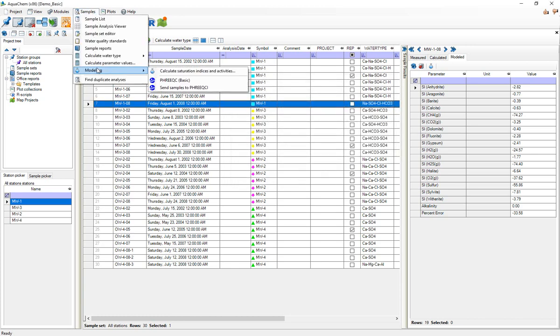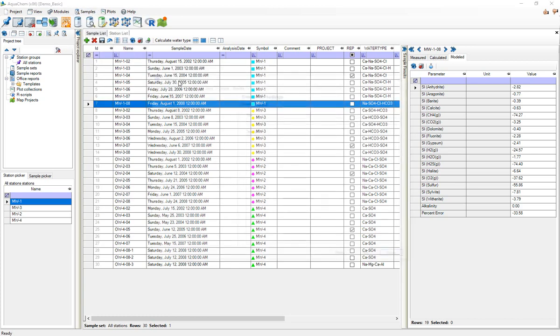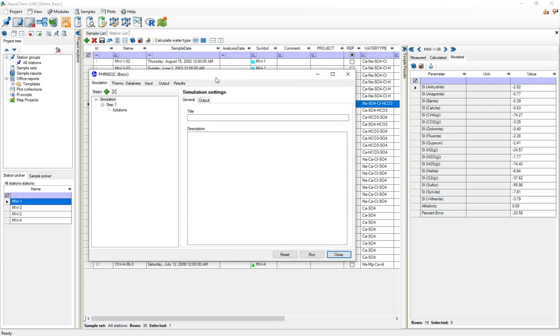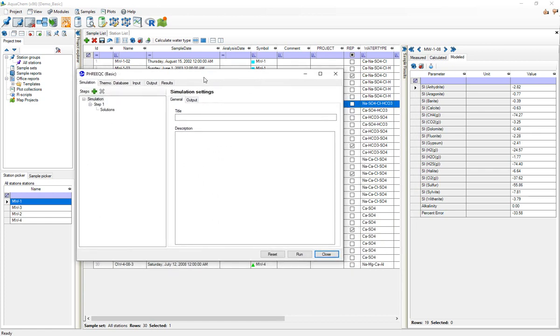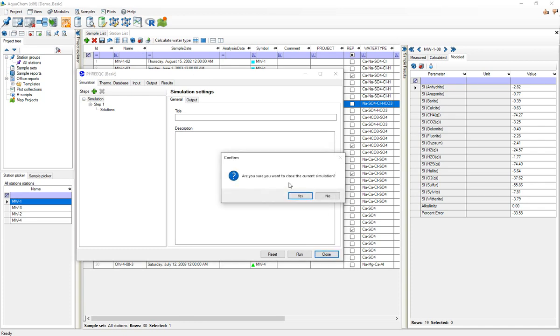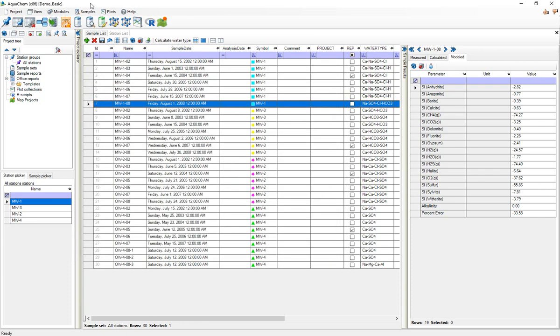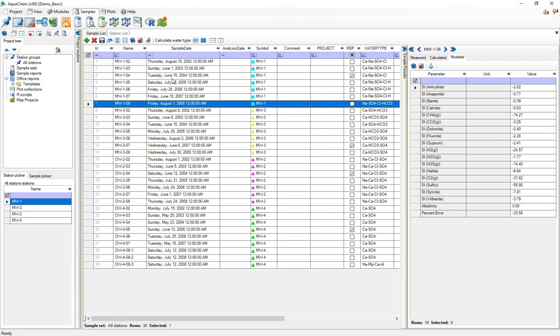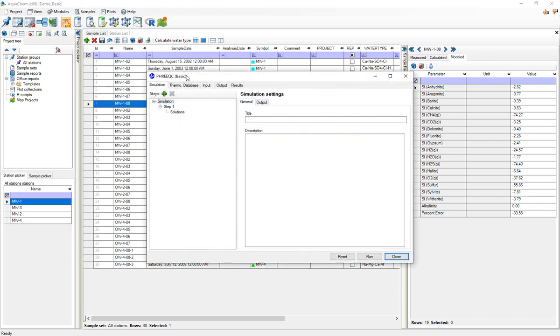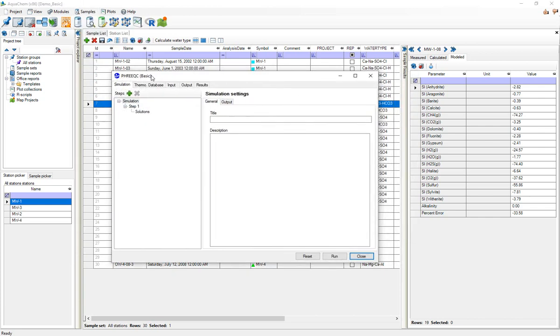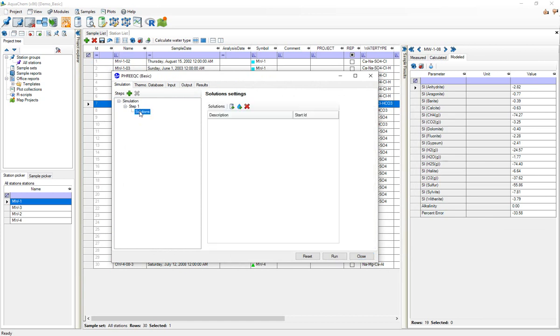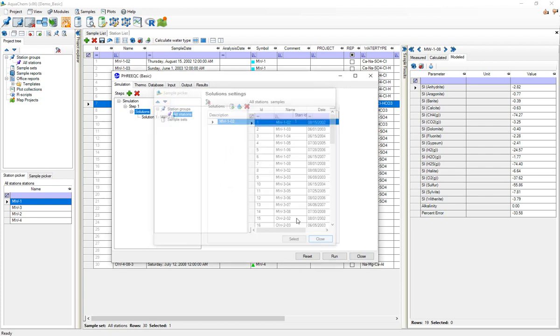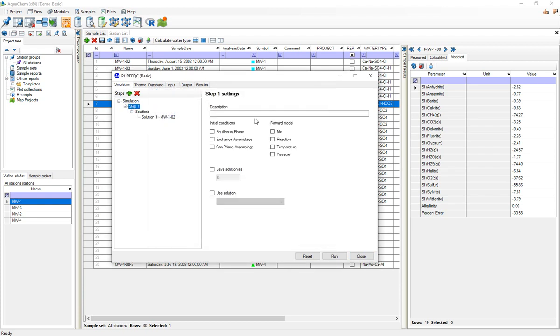You can also set up basic simulations. Again in a later video I will give a demo on how to actually use this but I don't want to make this video too long. To access that you would go to samples, modeling, PHREEQC basic, and that will open up this lightweight user interface where you're able to add samples from your database and perform different functions on them and also re-import the results. Again I'll talk about this in a separate video.